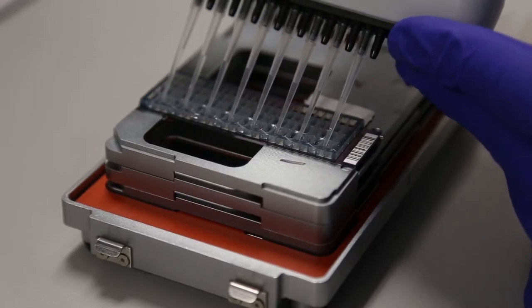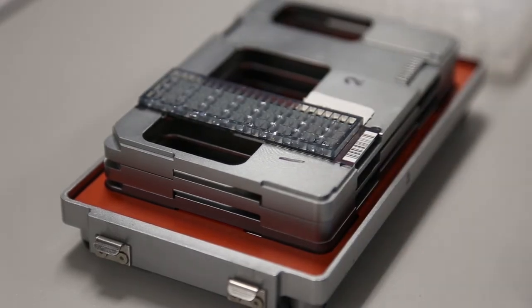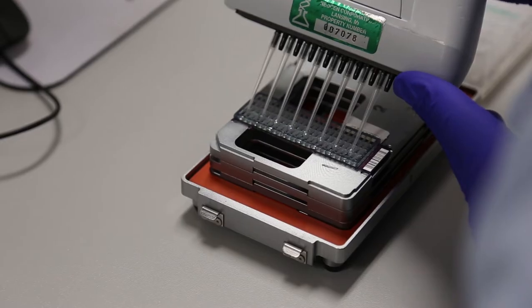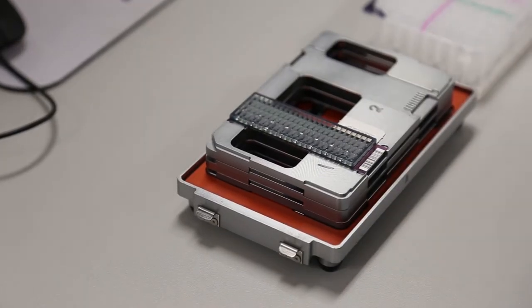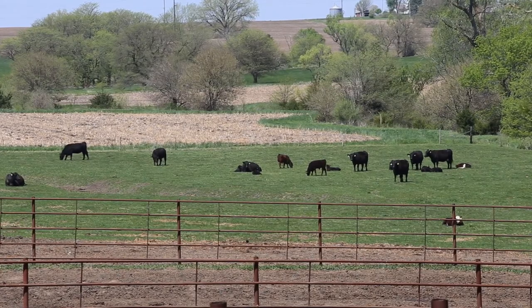In most cases, the next step is to place the DNA sample onto a chip, or what is known as an assay. This is designed to detect targeted variations in DNA. Those targets help govern how traits are expressed in a living creature. There may be specific parts of DNA that are of special interest.